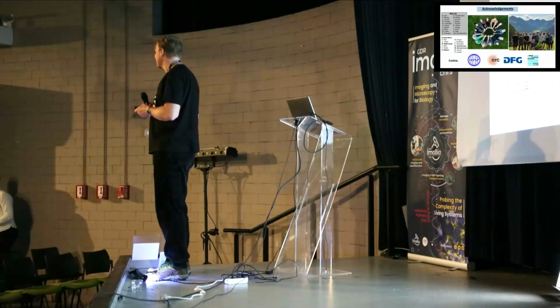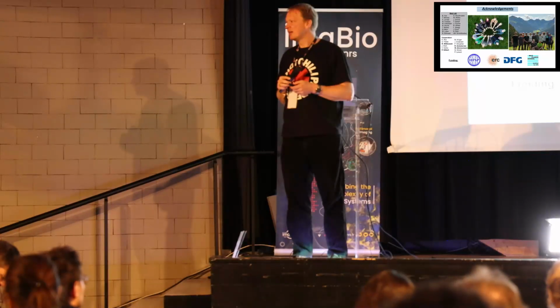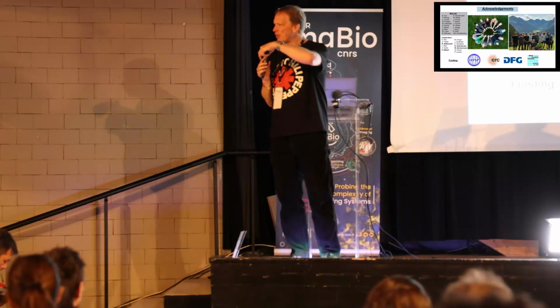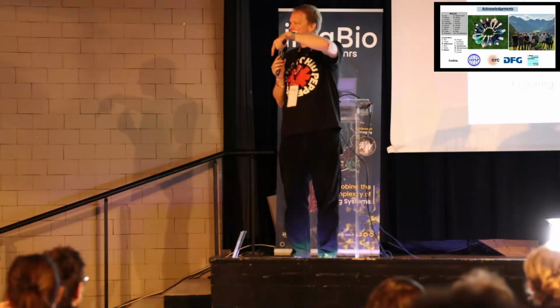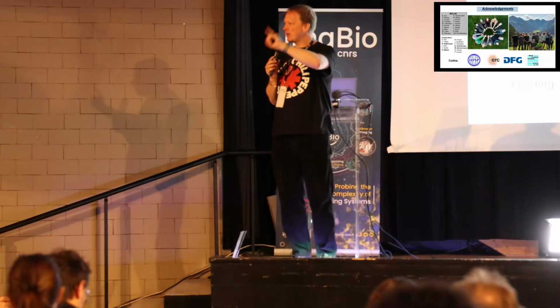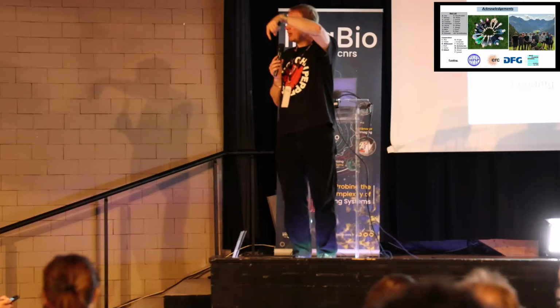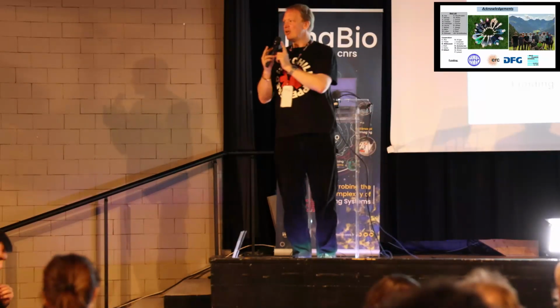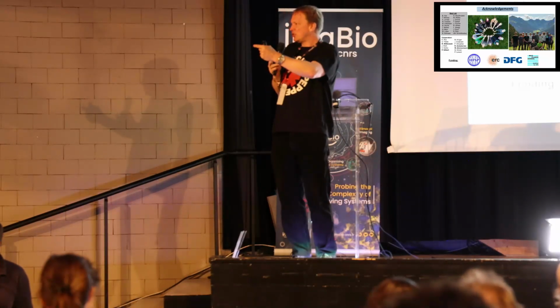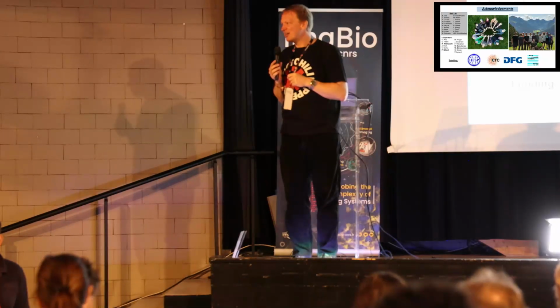Thank you, Timo, for the nice talk. Your posts are not circular in section. Is there a reason for that? Yes, we machine them out of PMMA, out of plexiglass. When you want to make them long, they start vibrating and break, so it's hard to machine. So we generated these ovals to make it stable enough to machine, in the direction where we need the lower stiffness. We have the same cross-section, but this change gives a lower stiffness in that direction. That's why. Thank you.